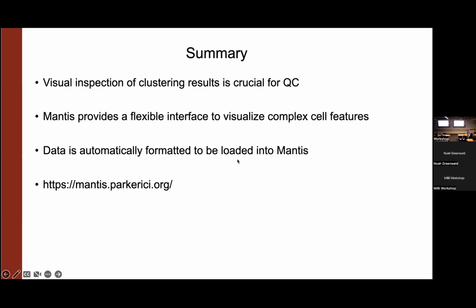Just pragmatically, why don't you tell people, for instance, when you guys are doing this iterative evaluation, about how many images you're looking at out of your cohort, that kind of thing. Yeah, so for my cohort, there are 1,200 FOVs.